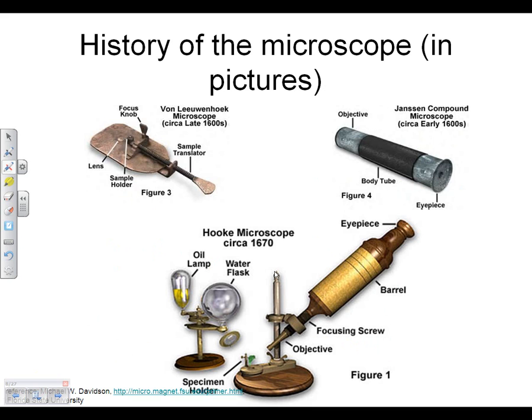And for those of you who know us by now, you know it wouldn't be a real background lecture if we didn't give you some amount of history. In science, it's always good to keep in mind what came before that allowed you to get to the point we have. So the next couple of slides are just some examples of the very first microscopes. And these three in particular are pretty important in history.